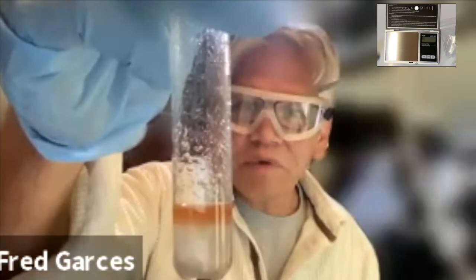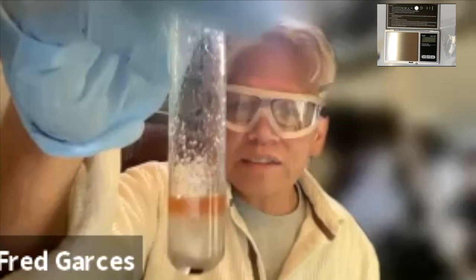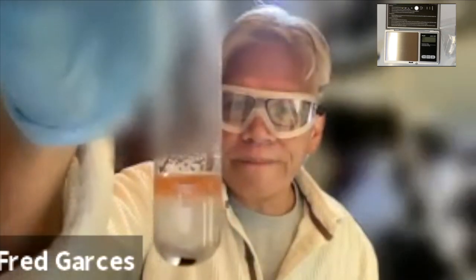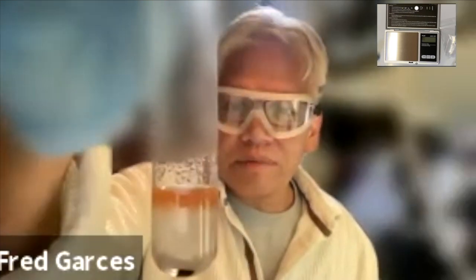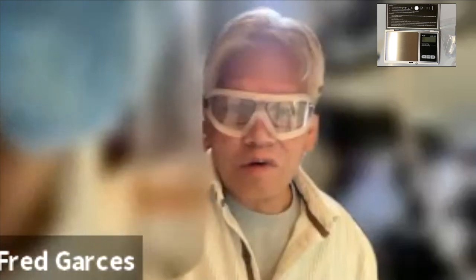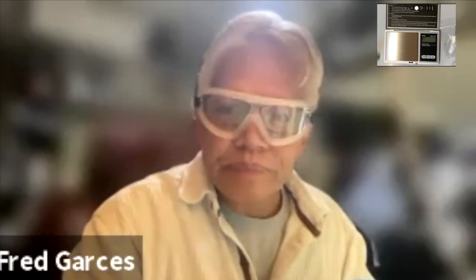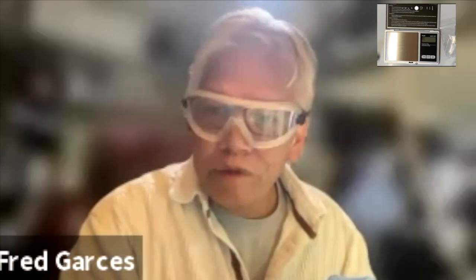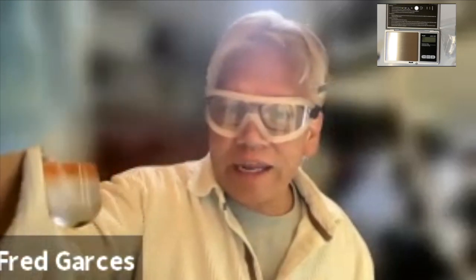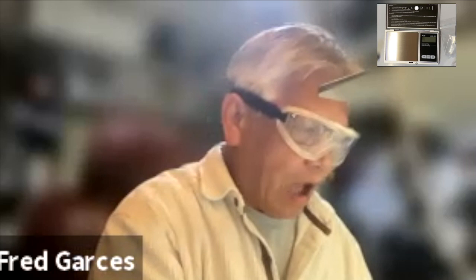But here you can see the separation. It looks like only, well, you guys need to do that conclusion. I'm not going to make the conclusion for you. Okay. But that's your experiment. I told you, easy peasy. Okay. You're basically just taking your liquid, you're weighing them, you're measuring the volume, and then you're mixing it, and then you're adding iodine. That's pretty much the experiment.